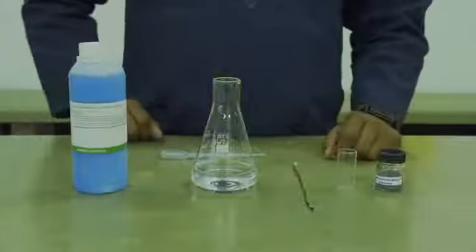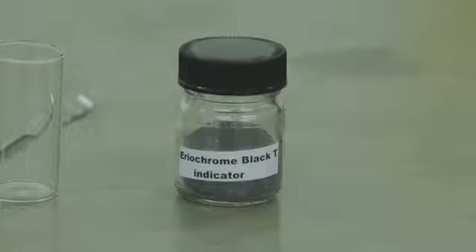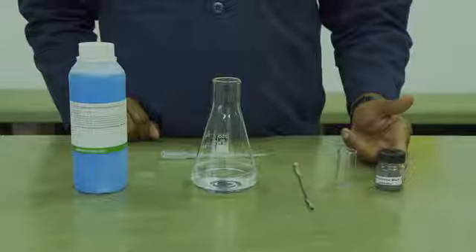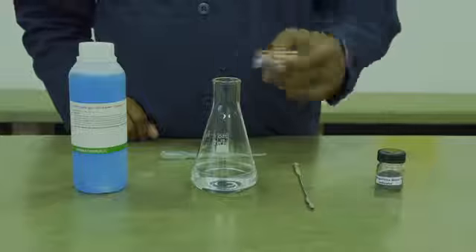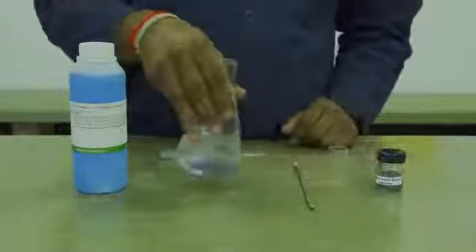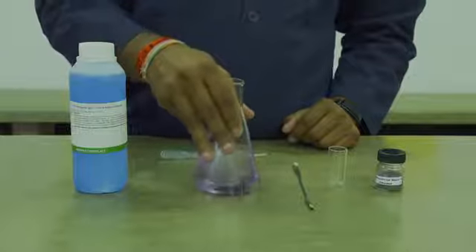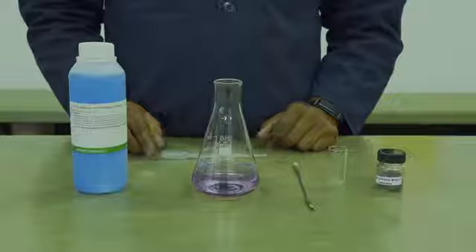Thereafter, you will weigh out approximately 0.1 g of the Eriochrome Black T indicator using a rough balance. Take your Eriochrome Black T indicator and add it to your sample and dissolve. The solution will turn to a pale purple color or a wine color.